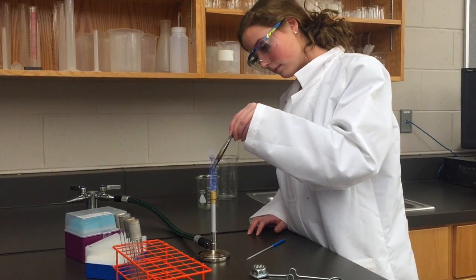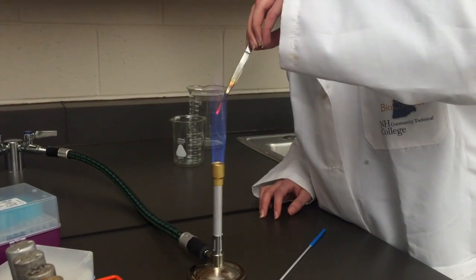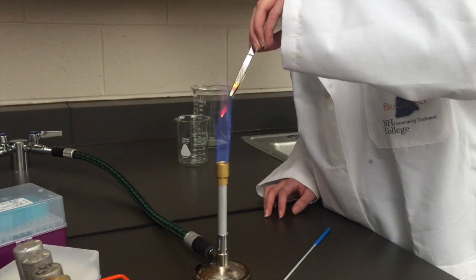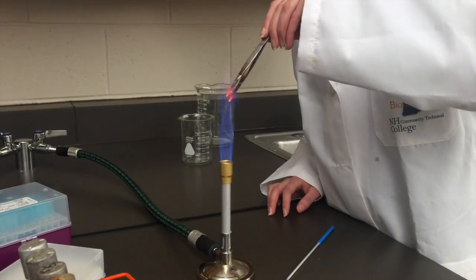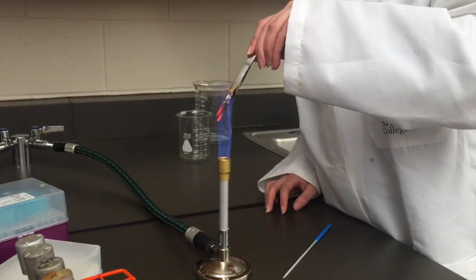This can be accomplished by flame sterilizing the forceps using the Bunsen burner. Hold the end of the forceps in such a way that the tip of the forceps is in the top part of the flame. After some time, the forceps will start to get red hot. You want to make sure that not just the tips of the forceps are getting hot, but the upper part of the forceps as well.